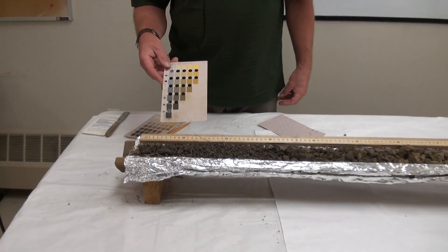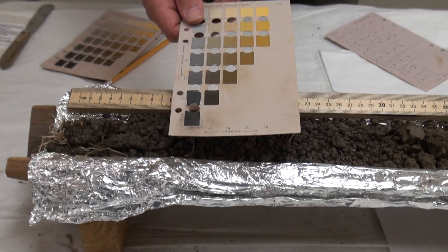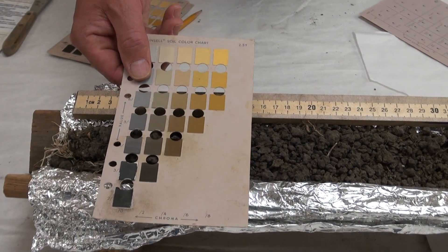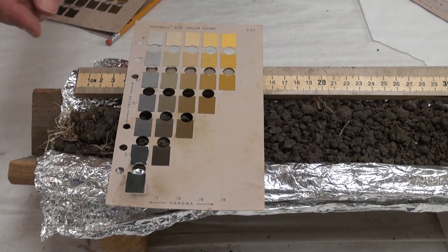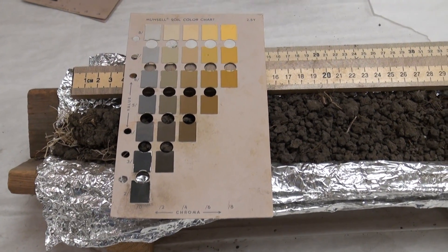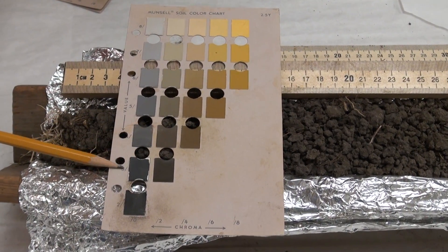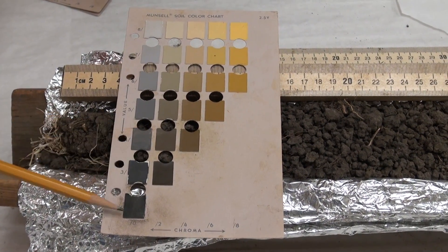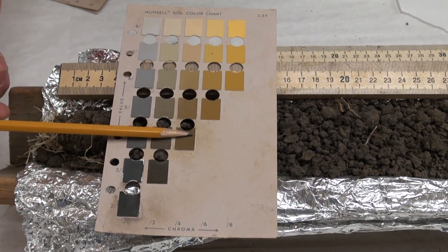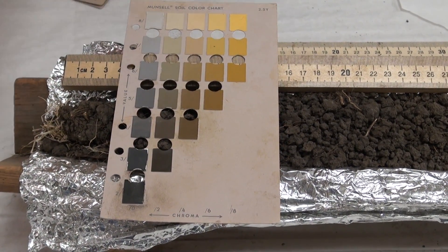This soil is pretty dry — it's air dry — so we'll try it as a dry color and then we'll go to a moist color. Near the top we're going to be looking at 2.5 yellow, value 4 or 3, and chroma 2. Make your determination and record on your datasheet for the top soil at a depth of about 8 centimeters.